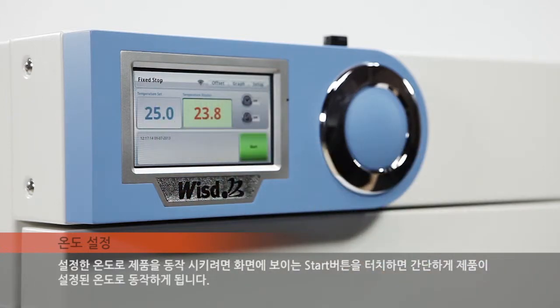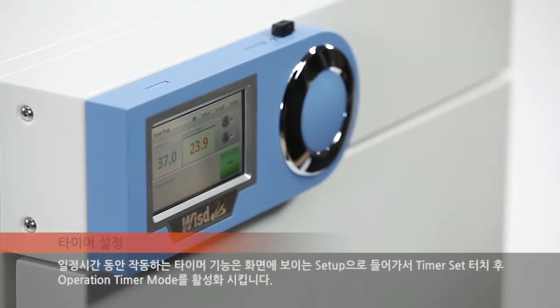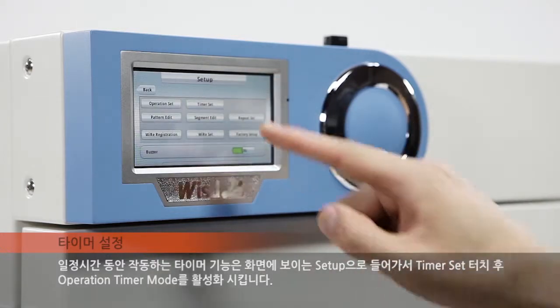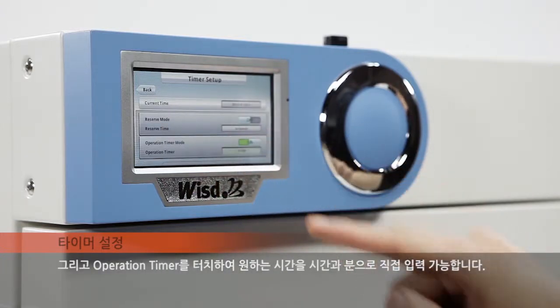To start operating the equipment at the set temperature, simply touch the start button appearing on the screen. The timer function, which drives the unit for a specified time, is accessed by going into the setup on the screen, then touching the timer set button and activating the operation timer mode.